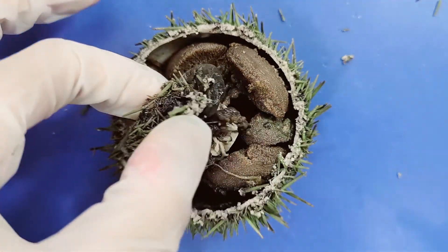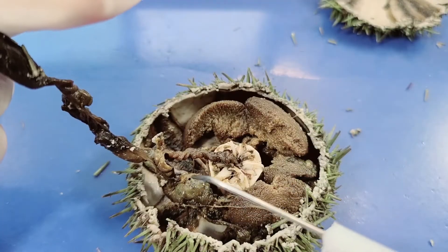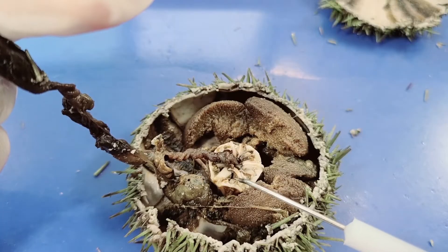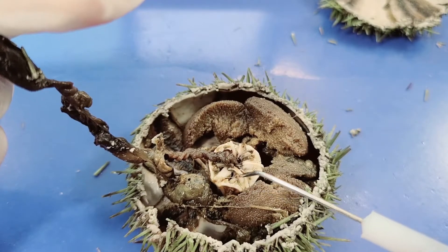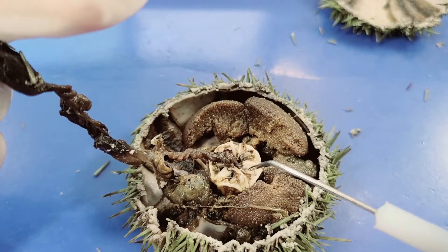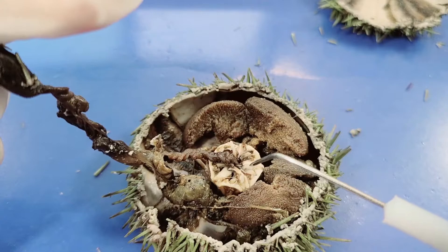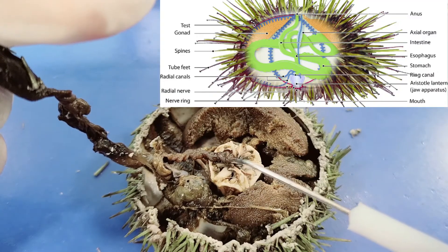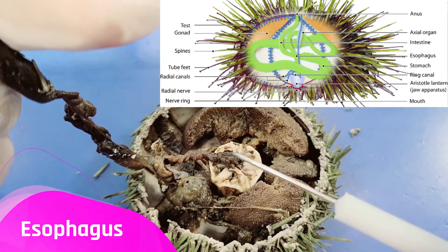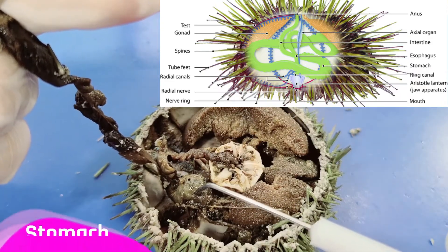Now I'll lift off this little cap and take a look at the digestive system. This complicated white structure in the middle of the body cavity is called Aristotle's lantern, and is a structure that contains the mouth and the pharynx. At the top of the lantern, the pharynx opens into the esophagus, which runs back down the outside of the lantern and then leads into the stomach.